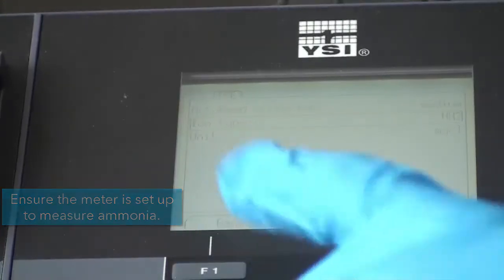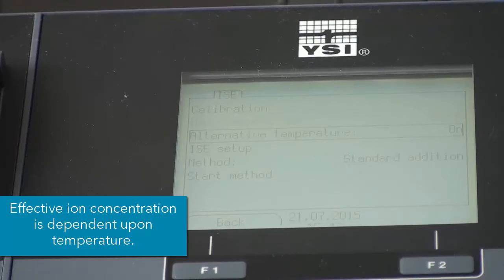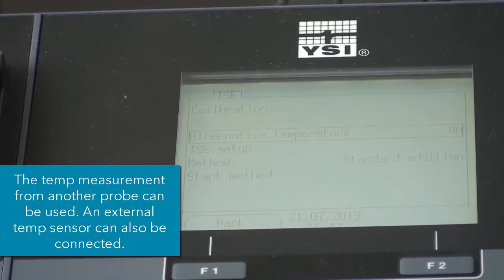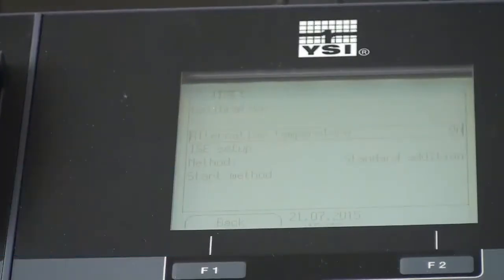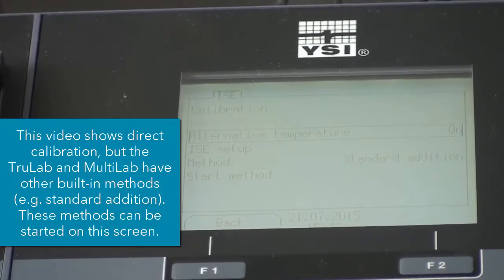So once that's set up, another thing that you can do is since the ammonia ISE does not have a temperature sensor built into it, you can actually use the temperature reading from another electrode that is connected to the meter, and use that and apply it to the ISE channel just to make sure that your measurement is compensated for temperature.